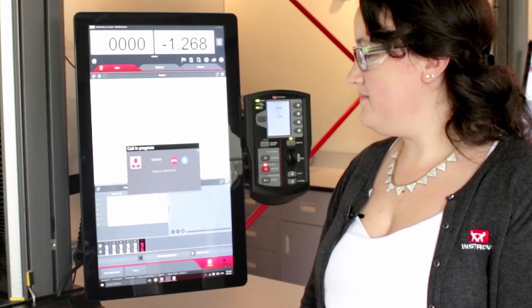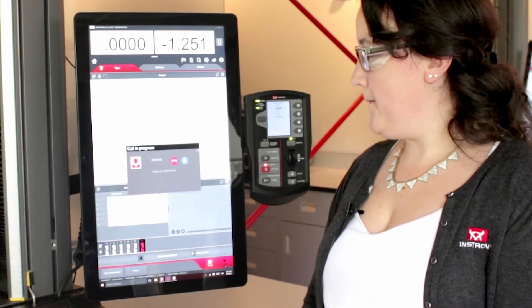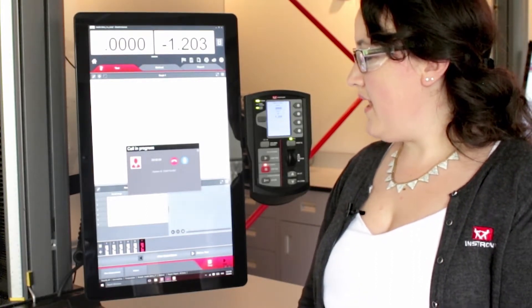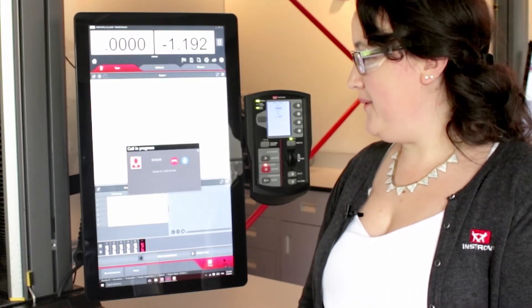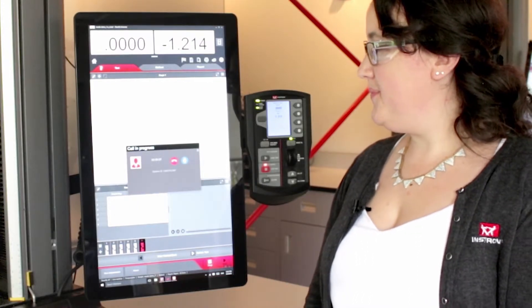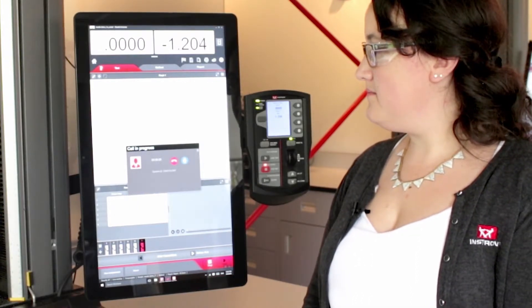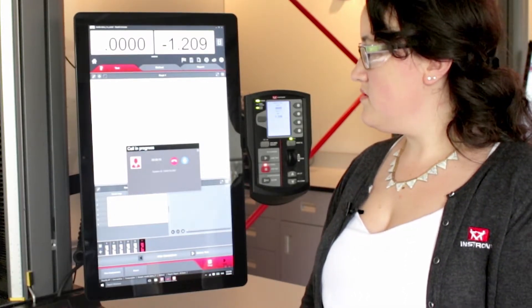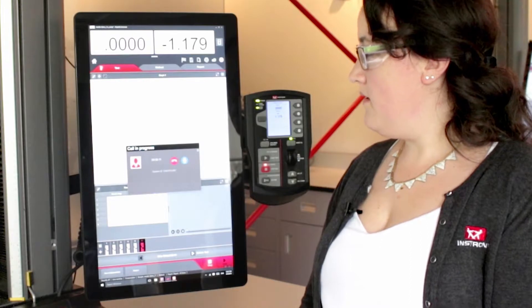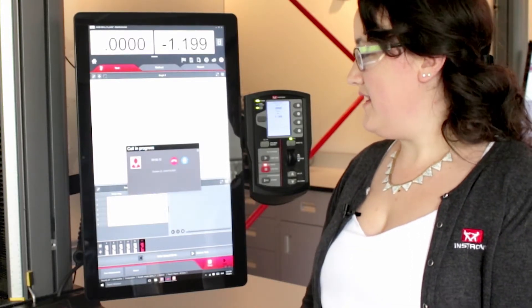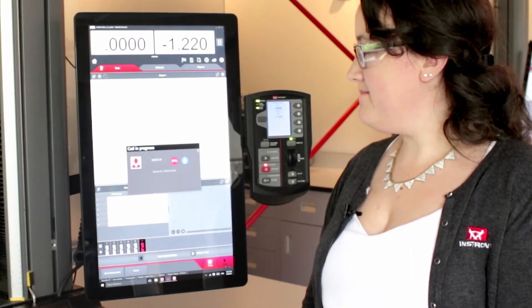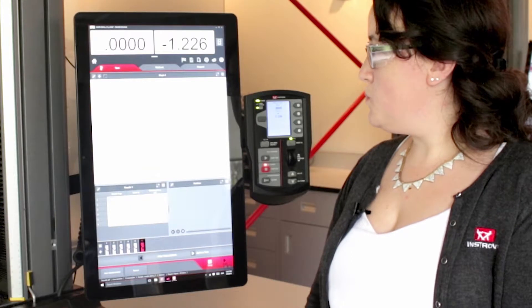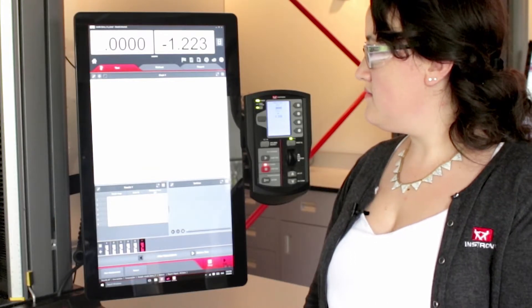Hello? Hi, this is Ian from Instron tech support. How are you? I'm good, Ian. How are you? I'm doing well. So it looks like you're requesting you want to add a calculation for force at a specific displacement? That's correct. All right, that's what we need to do next to take care of here.